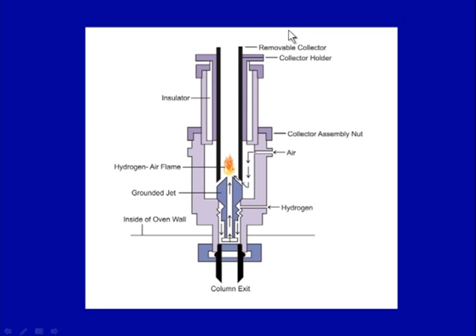So, this is very useful and most widely used detector, and like I said it has certain limitations that oxidized carbons cannot be sensed here. Then other groups like hydroxyl will have lower detection limits, and it is directly proportional to the CH2 groups. So, it is very useful for say environmental samples, and in pollution studies and a lot of other studies it is utilized.